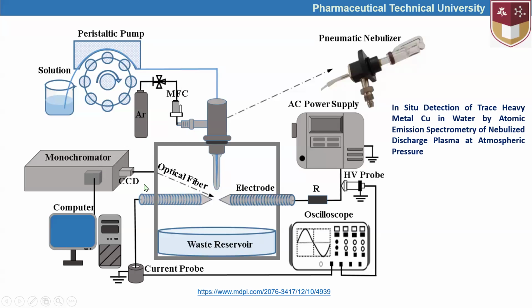So the light coming from the monochromator can be effectively used to identify the presence of some metals, even if they are in trace amounts. By using plasma like argon, the atoms are provided with the excitation stimuli. Then the light spectrum is determined and detected in the detector, so then automatically they can be identified. The presence of atoms can be identified by using tools like this.